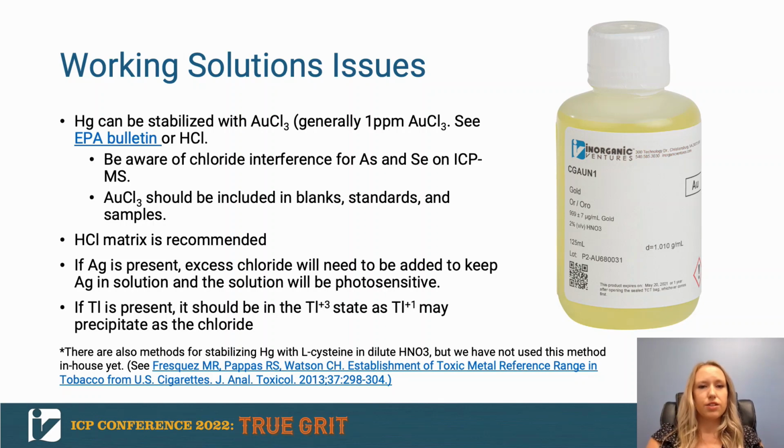This is also going to cause issues with silver if you have that in your solutions, as silver will precipitate with trace chloride, and it will also make the solution photosensitive, so you may need to add some extra hydrochloric acid to keep that silver stabilized.